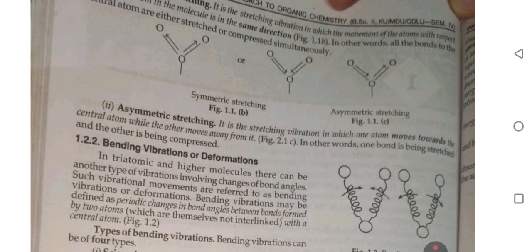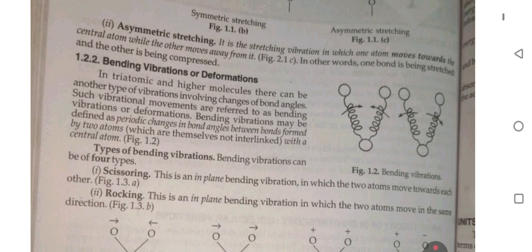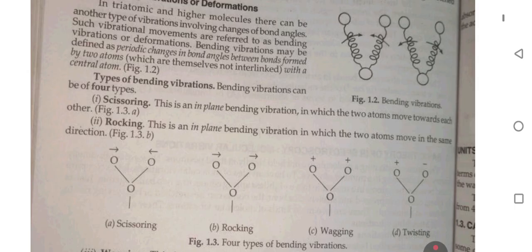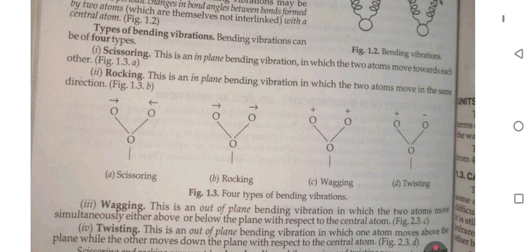Bending vibration or deformation: in triatomic and higher molecules, there can be another type of vibration involving change of bond angle. Such vibrational movements are referred to as bending vibration or deformation. Bending vibration may be defined as periodic change in bond angle between bonds formed by two atoms. Types of bending vibration: bending vibration can be of four types. Scissoring: this is an in-plane bending vibration in which two atoms move toward each other. Second, rocking: this is an in-plane bending vibration in which the two atoms move in the same direction.